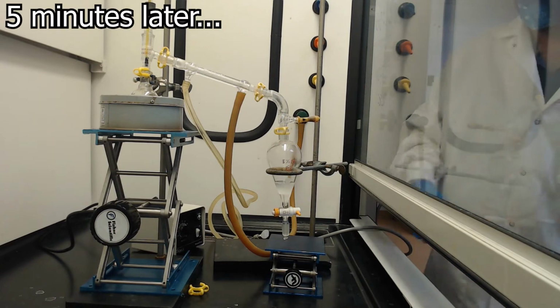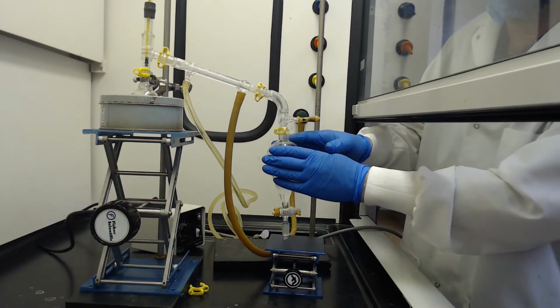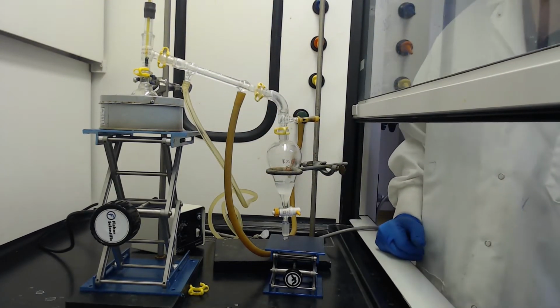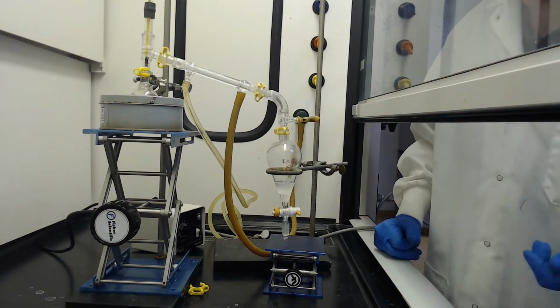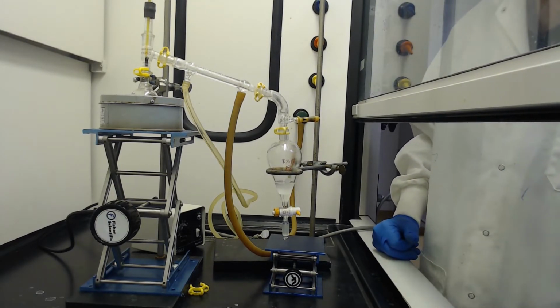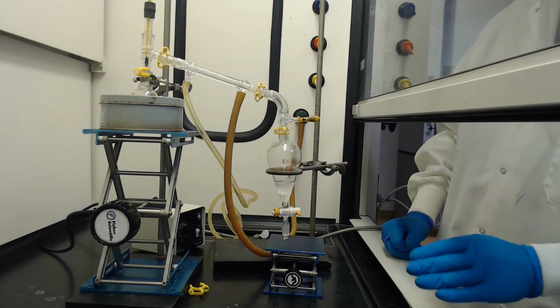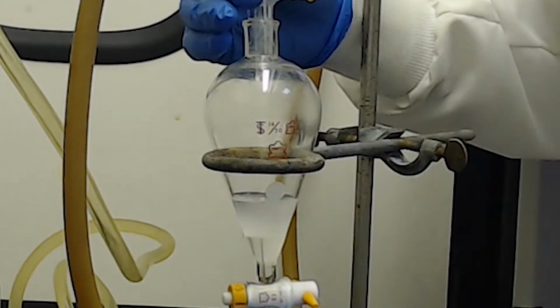Okay, so the apparatus is cooled off now, so we're going to start disassembling this, and we're really after this critter here. What's left back in the flask looks kind of thick and viscous. It's kind of a yellow, amber, almost orange-brown goo that's left in there. We didn't go to dryness, and we'll deal with cleaning that up later. The object of our affection right now is this.